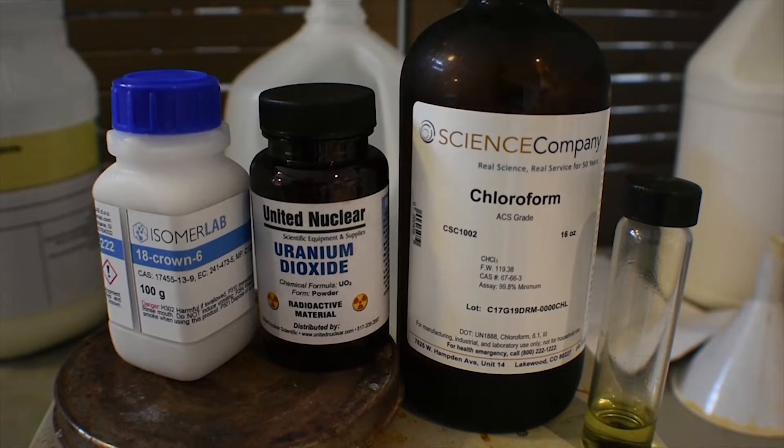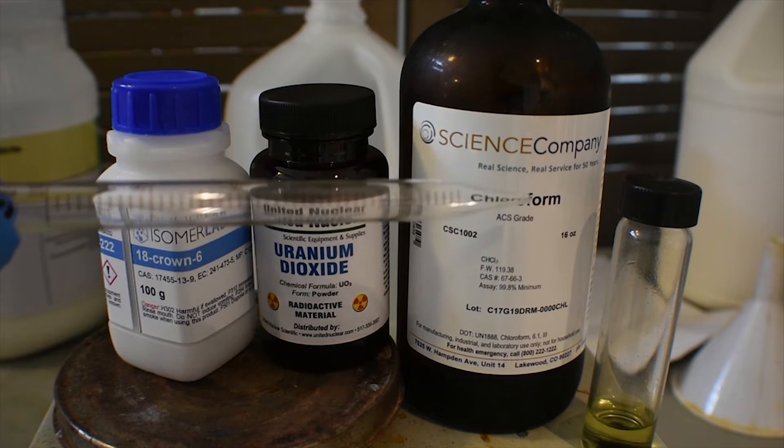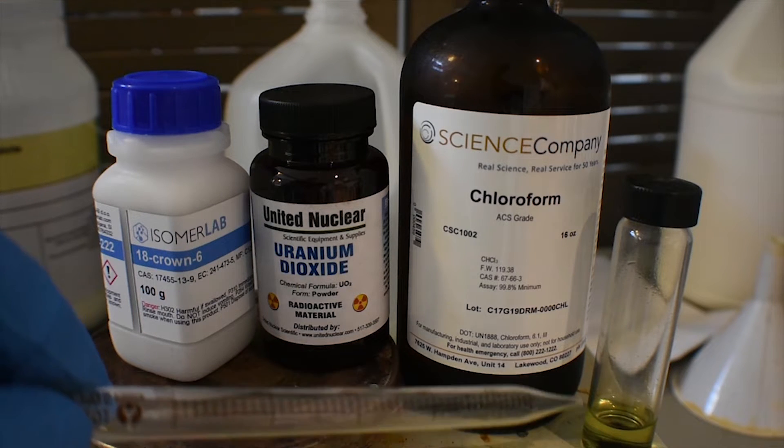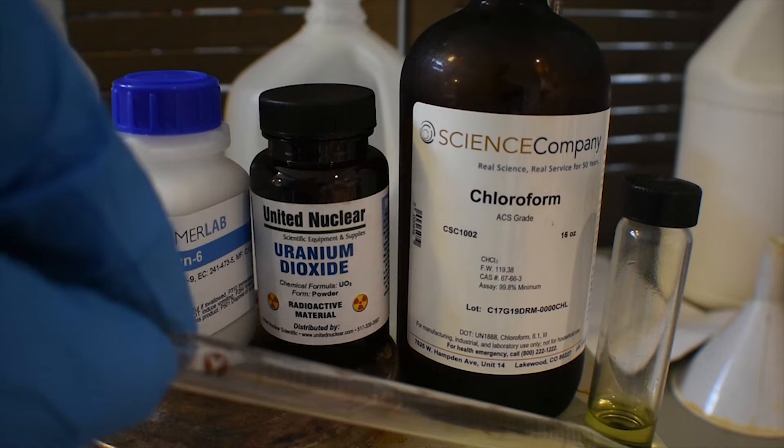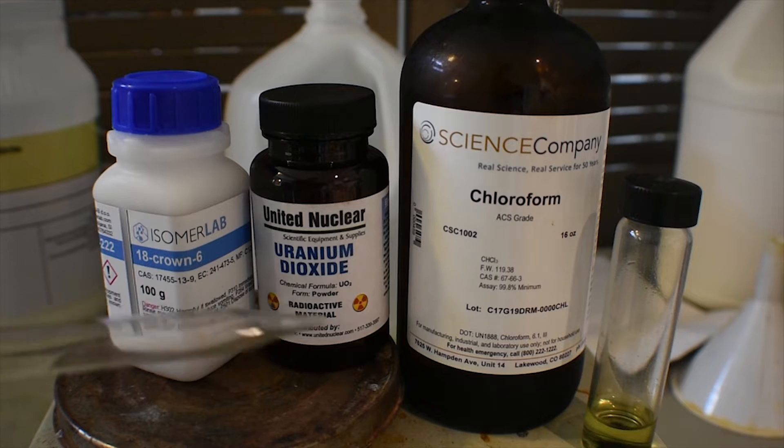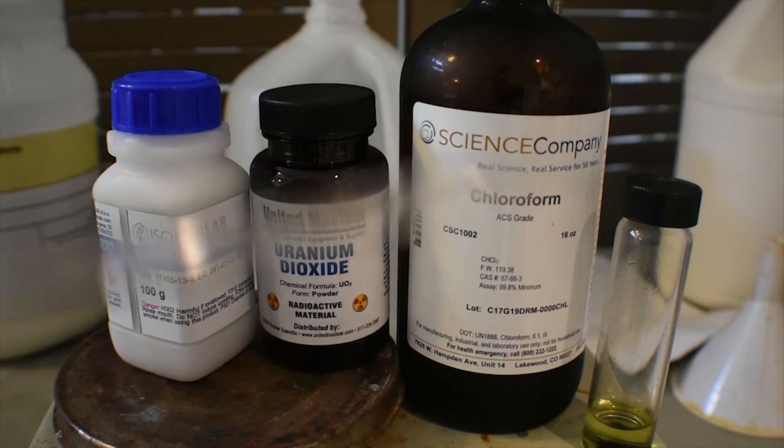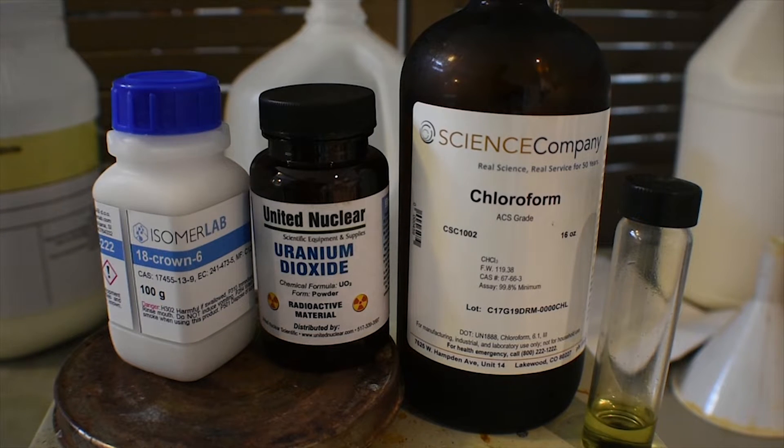My plan for this is to dissolve the 18-crown-6 in chloroform. Now, why I chose chloroform is because uranyl nitrate is not soluble in chloroform. It is soluble in water, and that's what it's dissolved in right now. So with the 18-crown-6 dissolved in the chloroform, the 18-crown-6 will also complex with the uranyl nitrate and dissolve in the chloroform, giving a green color, indicating that complexation has indeed occurred.